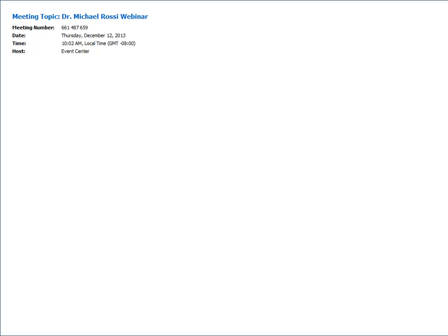Perfect. Okay, so we have one here. You were talking about combining technologies to get your answer. Does BioNano make very long reads, making PacBio unnecessary to answer such questions about structural variations, or would you still find such data useful? Yeah, I'm the type of person that thinks that all data is useful.